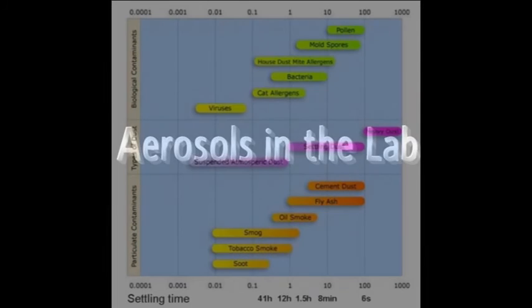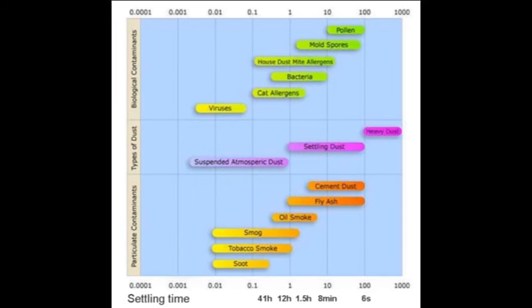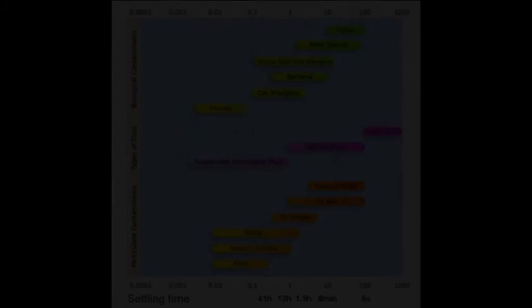There are many documented cases of laboratory personnel contracting diseases due to their work with infectious agents. Approximately 80% of these cases are assumed to be primarily related to the creation of bioaerosols in the lab. Aerosols are defined as colloidal liquid and solid particles suspended in a gas, usually air. A bioaerosol is a collection of airborne biological particles with sizes ranging from 0.5 to 30 micron.